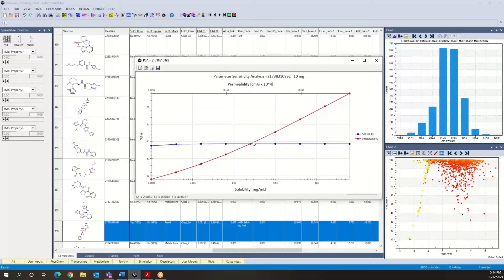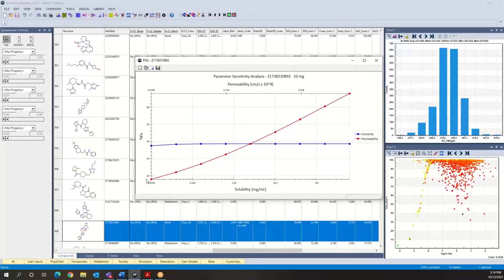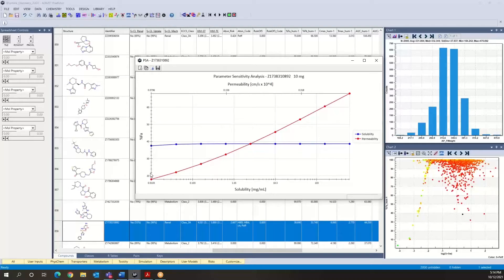On the other hand, if we fix solubility and vary permeability, then we see that we can potentially affect fraction absorbed, the predicted fraction absorbed, to a considerable effect. So that is one observation that we can make.